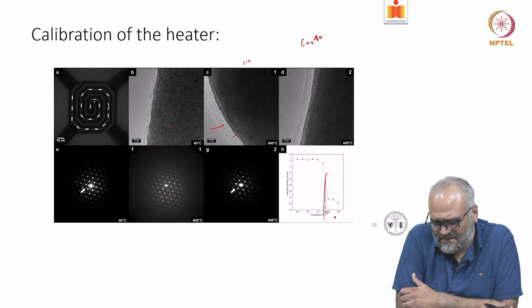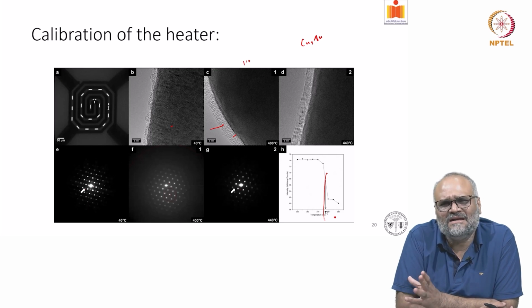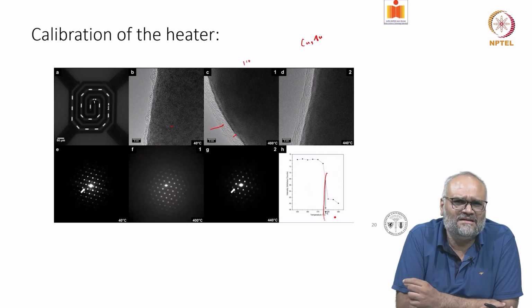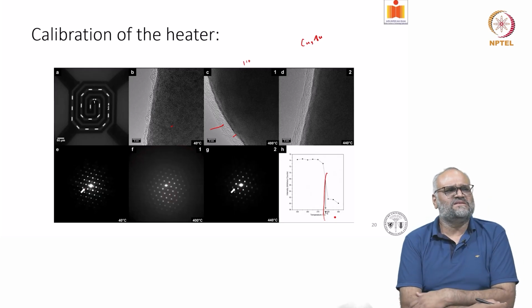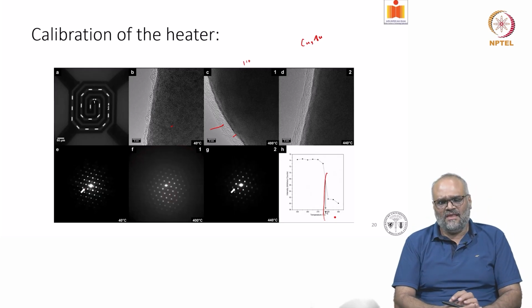So you are more or less within a 10 degree centigrade range of the temperature. So the calibration of these MEMS heaters is also pretty fine.